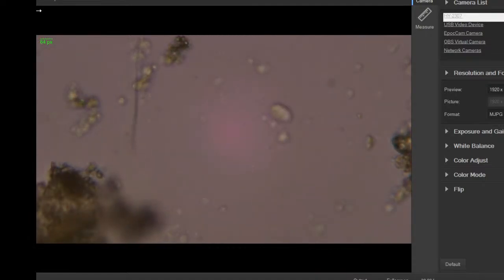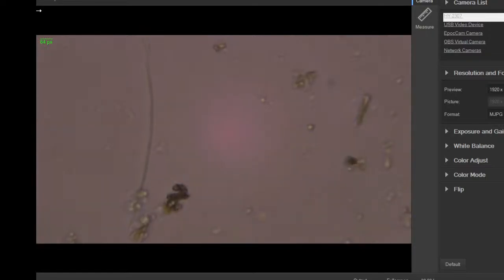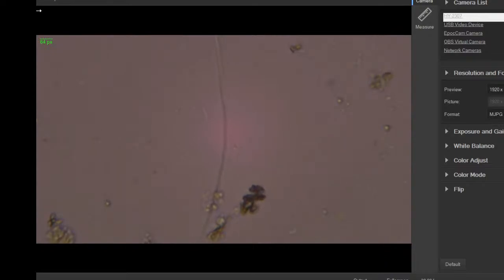And there's a filamentous bacteria in there. See that little line of stuff flexing left and right in the middle? That's a little bacterial colony. Might even be a very small one. Some of the blue-green algae have that kind of structure and they're very small sometimes. But it could just be a colonial bacteria. And that kind of wiggle dance there. There's no color to it, so it's probably a little bacterial colony.